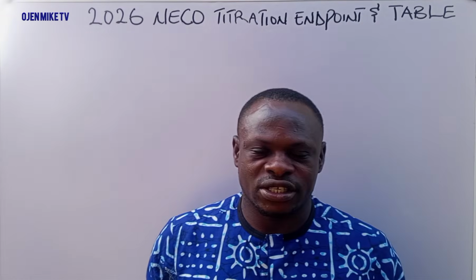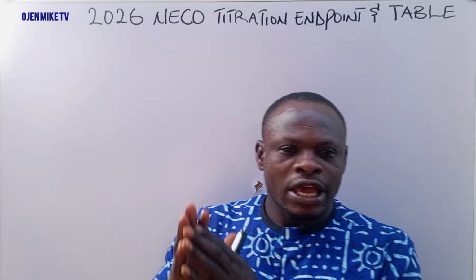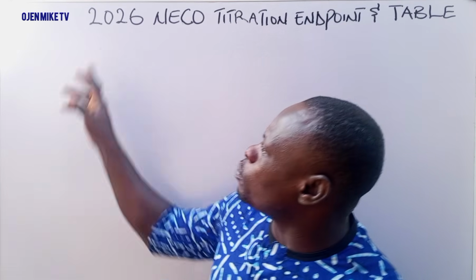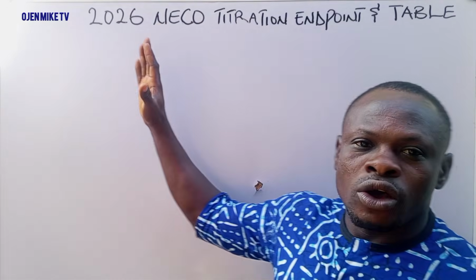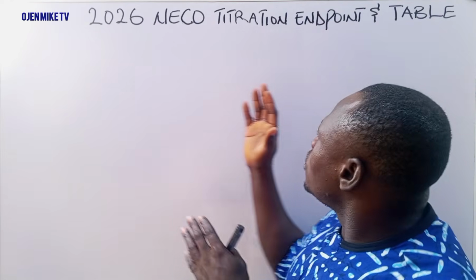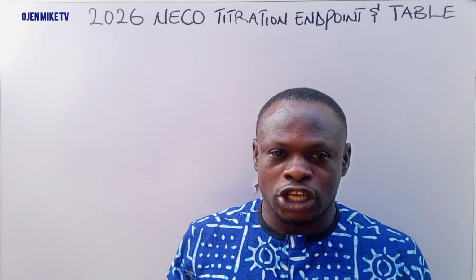Hello my lovely viewers. In today's video, we want to begin the journey of Chemistry NECO Practical 2026. As you can see on the board, 2026 NECO Titration Endpoint and Table. So we are going to determine the endpoint, and I will give you the table which you are going to use for your NECO examination.